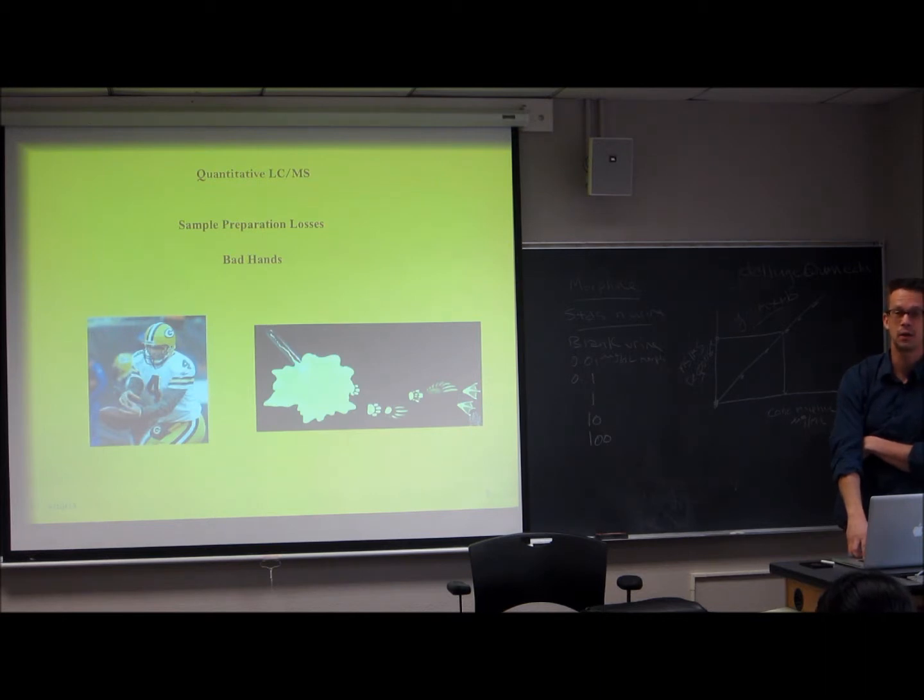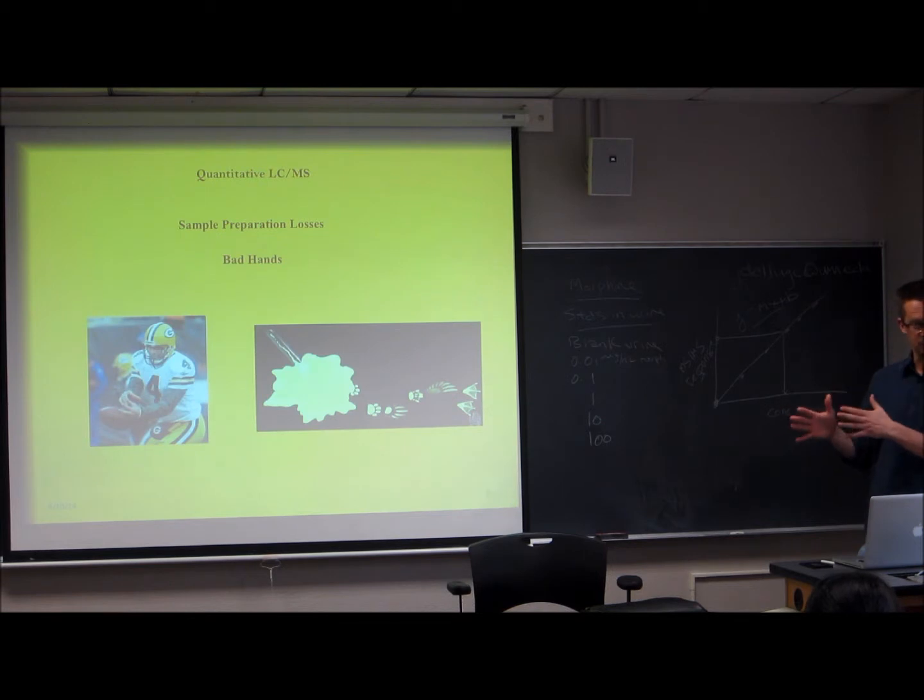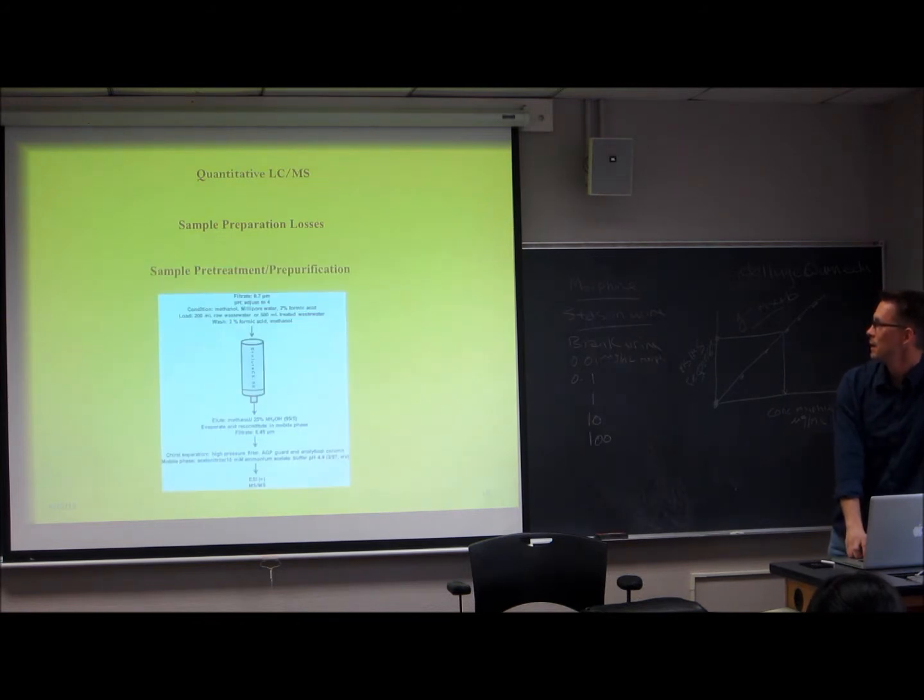Any others? I saw a hand go up. Yeah. Well, you might not always be able to make up your standards in a similar matrix. That could be a limitation. Yep. And we'll talk about a specific problem of that, and that is, depending on what matrix you're running in, it's going to affect the response of your compound. So this kind of goes hand in hand with what we were talking about before with sample losses.